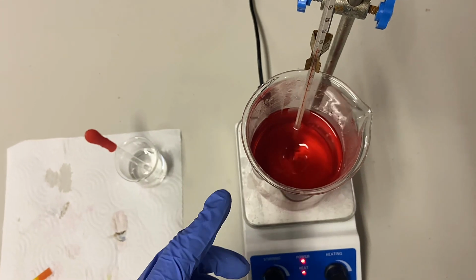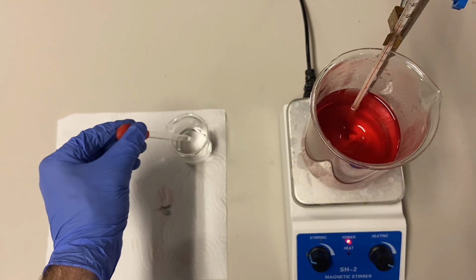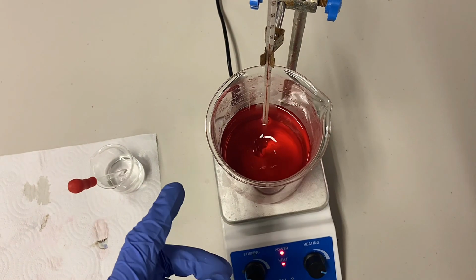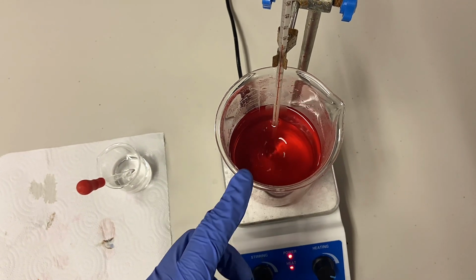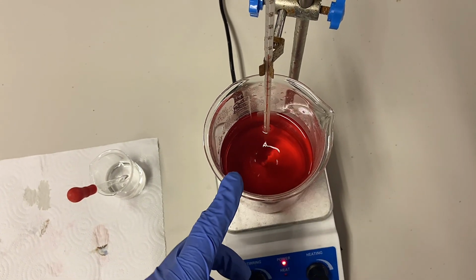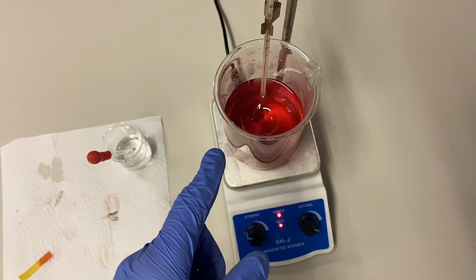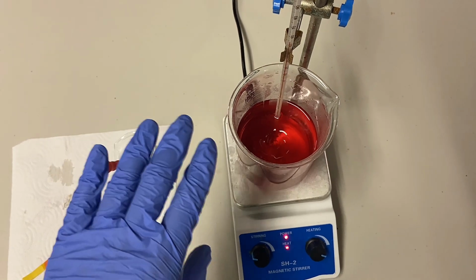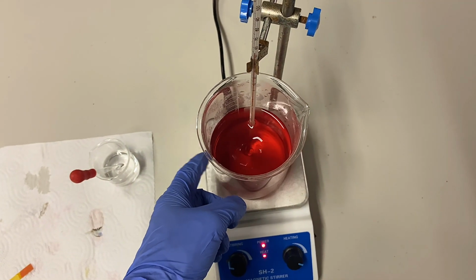And what I'm going to do after it's at that point is drop in a little bit of this, which is just an oxidizer. What that oxidizer will do is, at really high temperatures in a pretty much neutral solution, it will oxidize out the manganese as manganese dioxide, which is a solid precipitate. I can then filter that out and I'll just be left with filtered manganese dioxide. It should be very pure, and then lithium, cobalt and nickel still in the liquid solution.